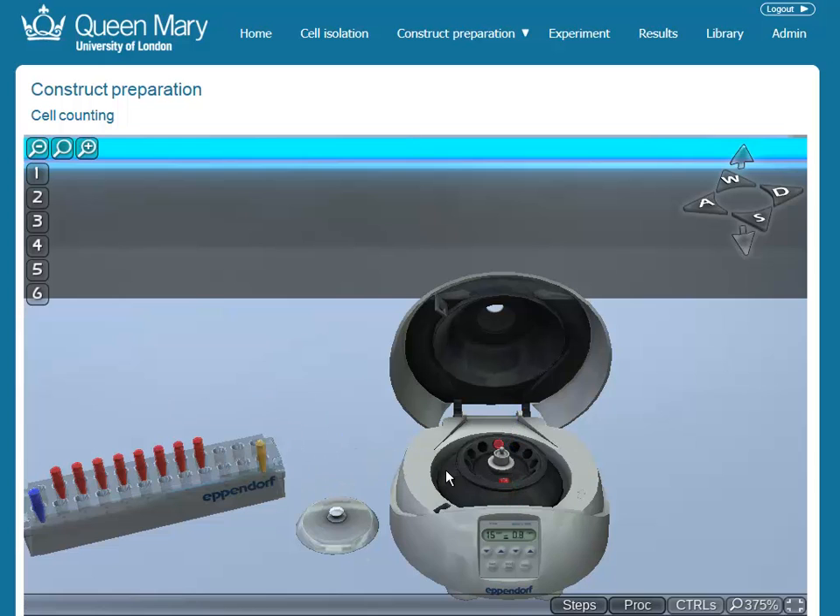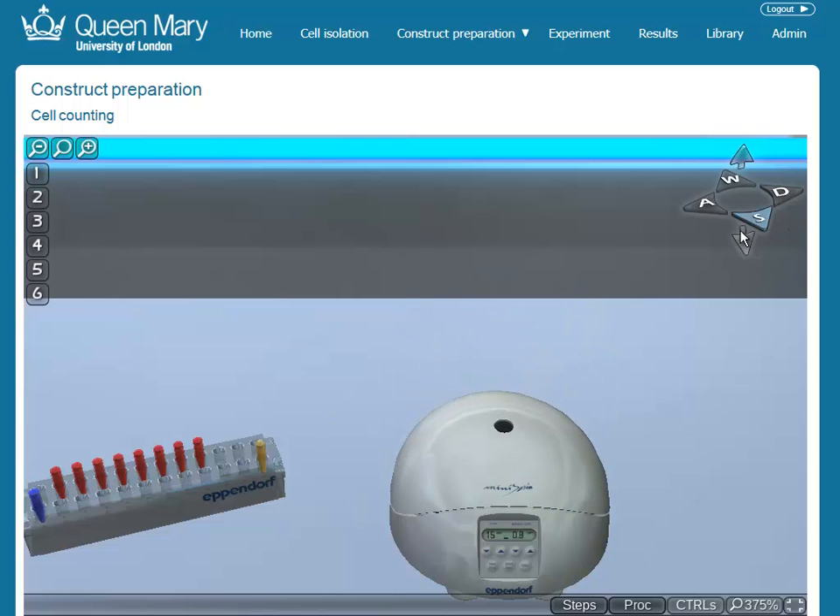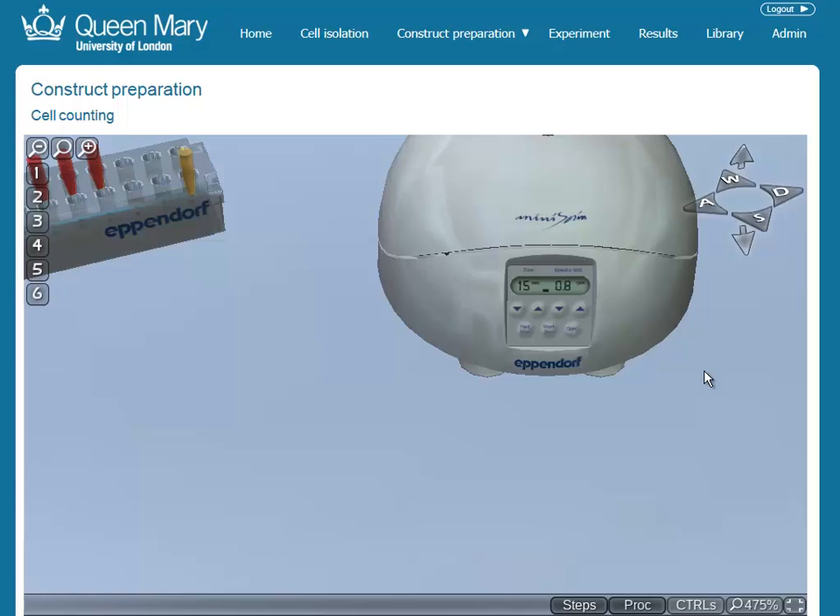The platform is designed to be as realistic as possible, and one of its unique features is the emulation of real equipment and their control interfaces. Here you can see a virtual version of an Eppendorf centrifuge in use.